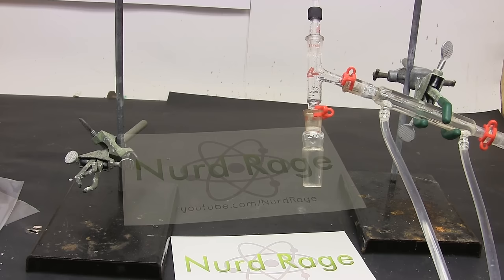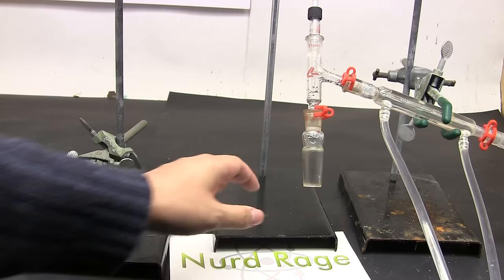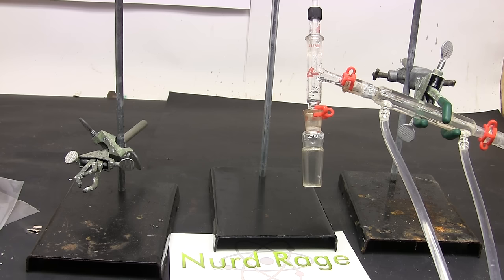Lab stands and clamps are yet another annoying thing that you don't know you need until you need them and forget to buy them when you don't need them. They hold up glassware and whatever else you're doing. I've seen so many of these selling for ludicrous prices so be sure to shop around. You can even make your own lab stands with a solid wooden base and some metal bars you can buy at a hardware store.